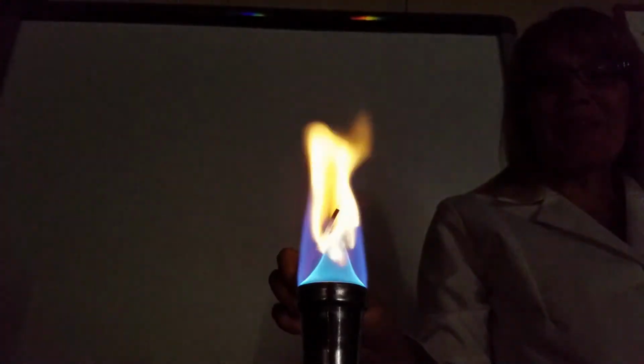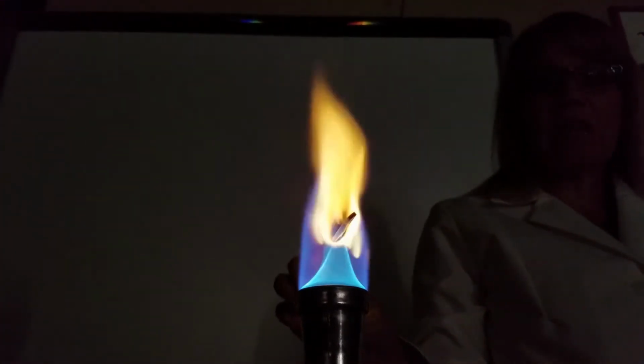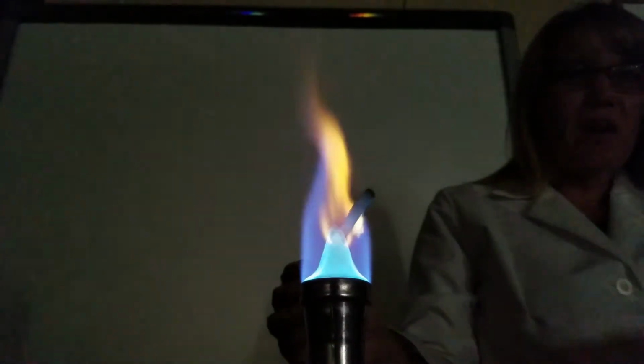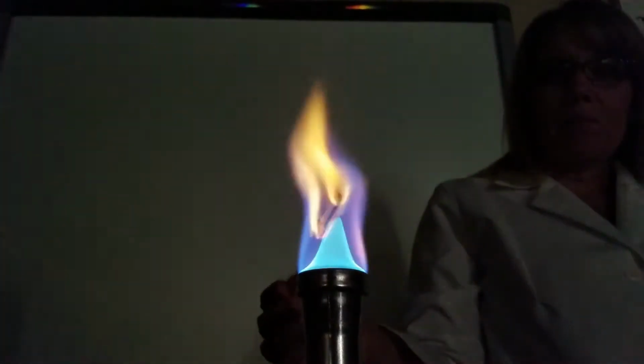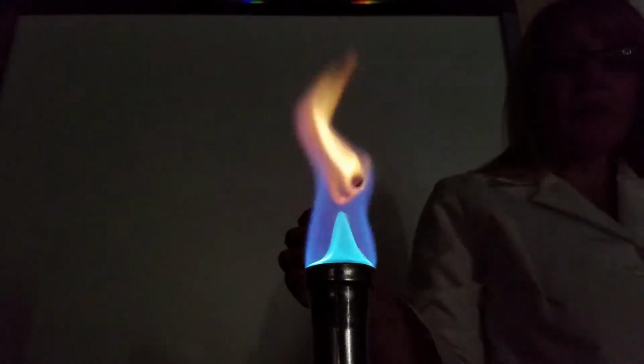So this first one that I'm putting in the flame is barium chloride. So what I want you to do is on your data table, I want you to observe the color of that flame. The blue at the bottom is just the propane burning, but the flame above the stick, and record your observations, describe that color.